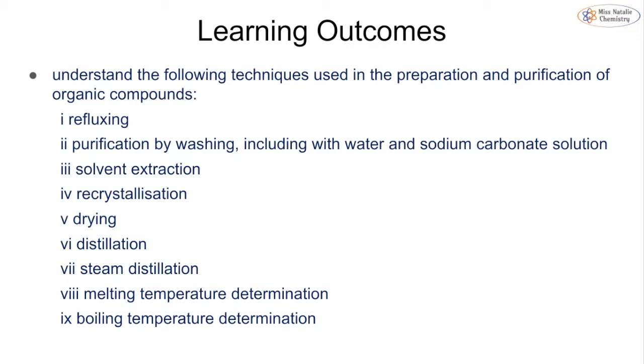And we are going to be looking at refluxing, purification by washing, solvent extraction, recrystallization, drying, various different types of distillation, and how we can determine melting and boiling point. And then we'll look at a past paper question at the end.